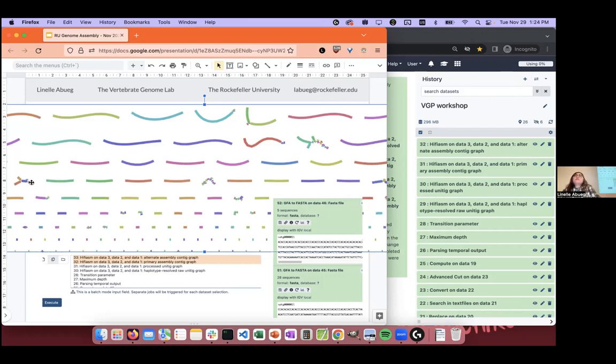Usually they are big tangles of repeats that are very hard to resolve. If those regions nicely separate, it'll be a cute little neat bubble where it's homozygous, heterozygous bit, homozygous, and that's what the raw one looks like. The raw one is a lot messier than this. This is one that's already been simplified down. This one has already called a path to walk. That's why they're so smooth on the top.